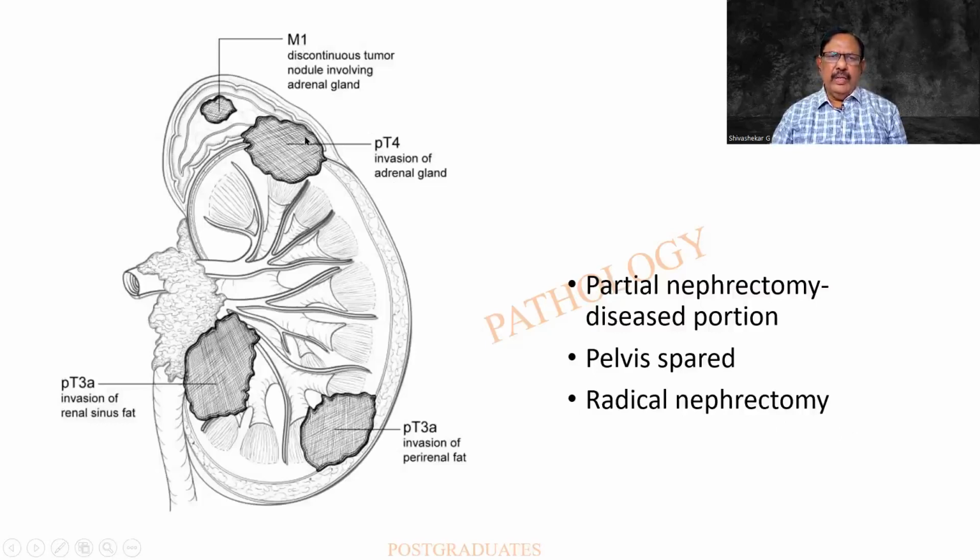There is a tumor in the region of the superior pole. There is an invasion of the adrenal. And there is also a nodule over here. Now it can be an independent tumor on its own, an adrenal adenoma, or it can be a metastasis from over here. All said and done, sampling will be very crucial from the tumor and the adjoining tissue.